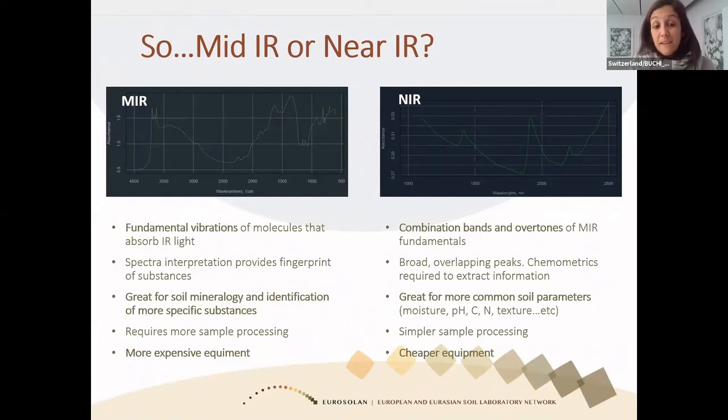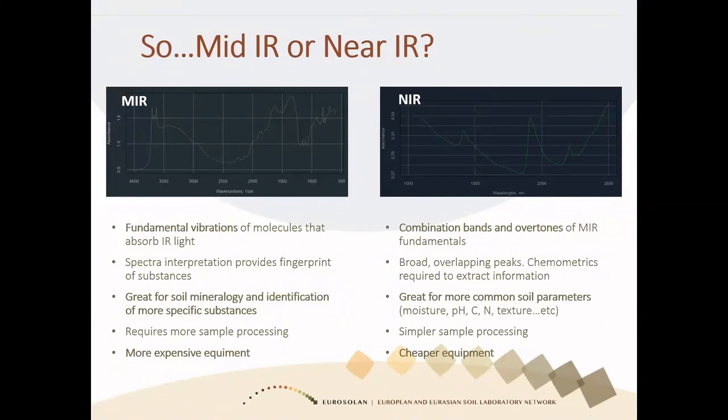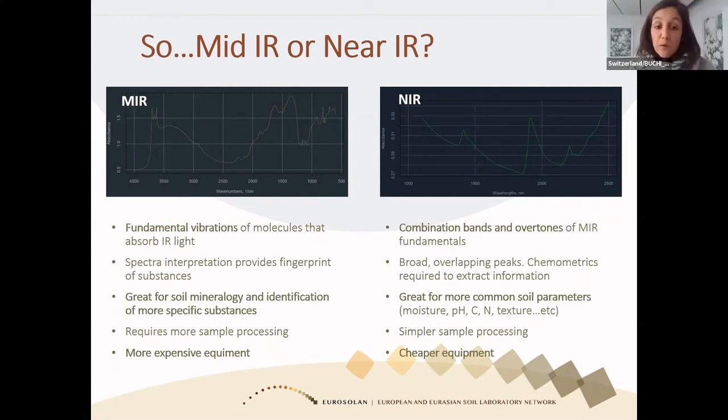But the thing is, MIR is more expensive than NIR because the components and the spectrometer inside are made differently. MIR is made of more expensive materials, let's say. So it can be more expensive. So it will always depend on what your needs are. If you just need the device for general, common routine analysis, perhaps with an NIR, you're fine.